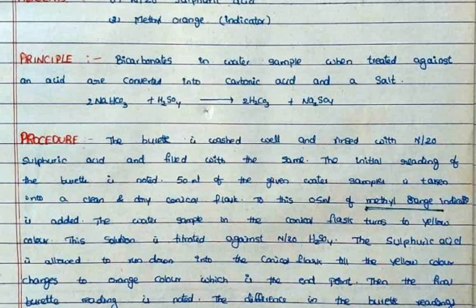Okay, principles. Bicarbonates in the water sample, when treated with an acid, are converted into carbonic acid and a salt.